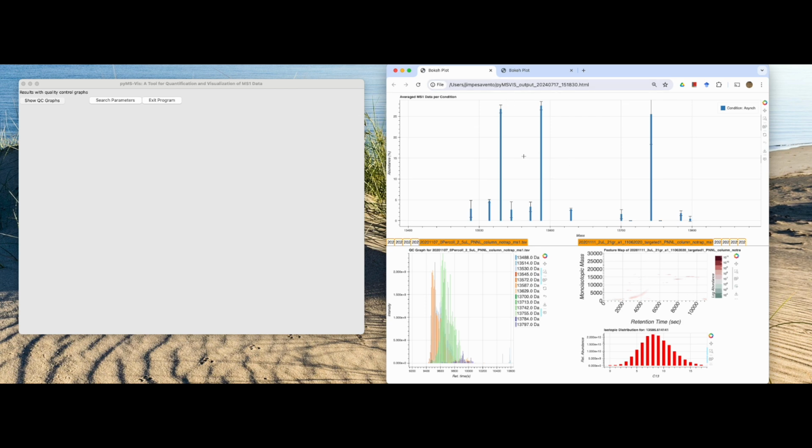Now, this is without adjusting the retention time quantitation. This is with, and you can see minor differences. The reason for the minor differences is, again, most of the intensities are in the major peak, even in cases where you have a really strong peak spike right over there. It's only for a couple scans. So that's why there's not a lot of difference, but this is obviously more representative of your intensities than this one, even though the error bars are not significantly different.